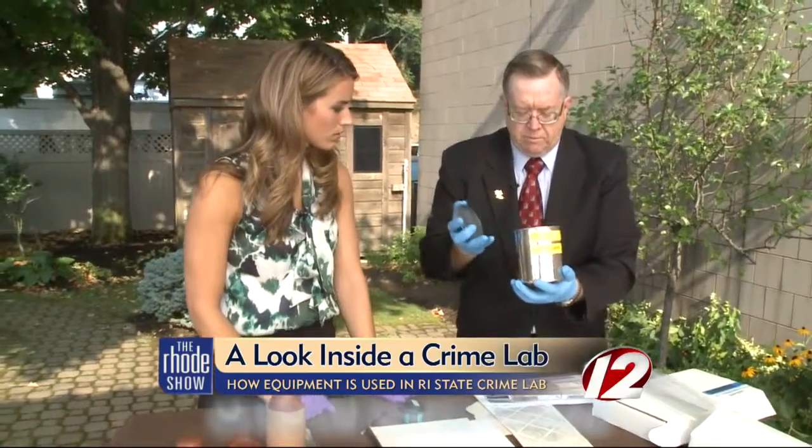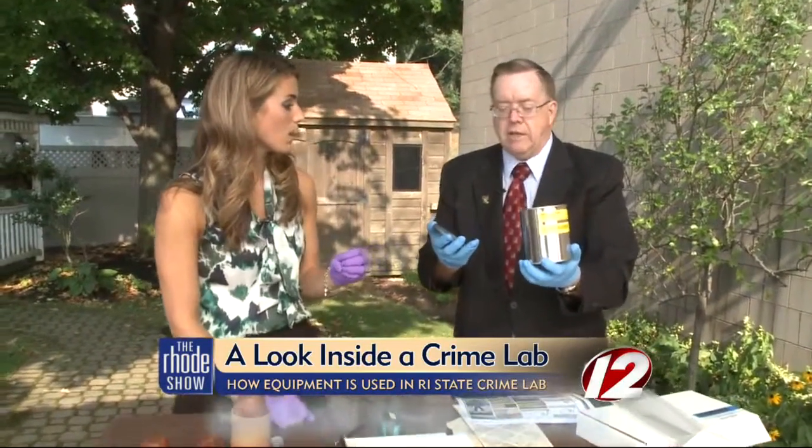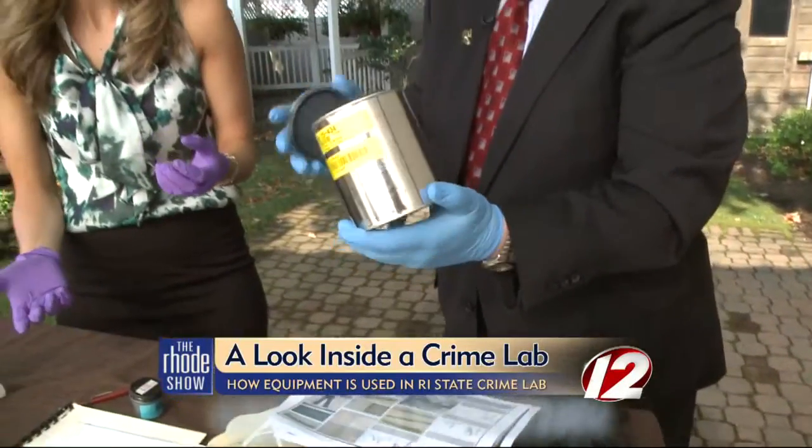This is a clean paint can — it's for fire debris, so if we're trying to determine whether an arson occurred. We're looking for accelerant, we're looking for gasoline. If you put fire debris in a bag or a box, the gasoline is going to evaporate on a warm day. So you put it in here, close it up, seal it, tape it up, and send it down to the laboratory — and then it stays stable for quite a long period of time.